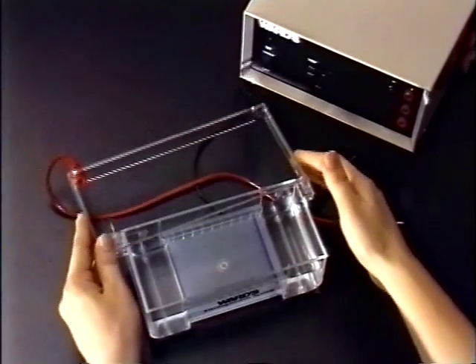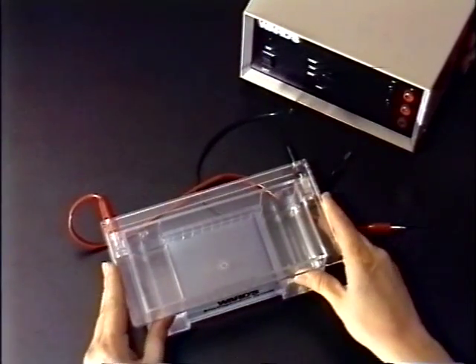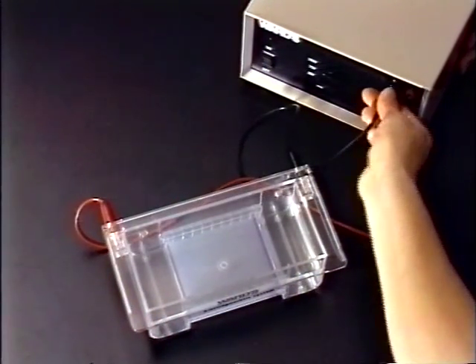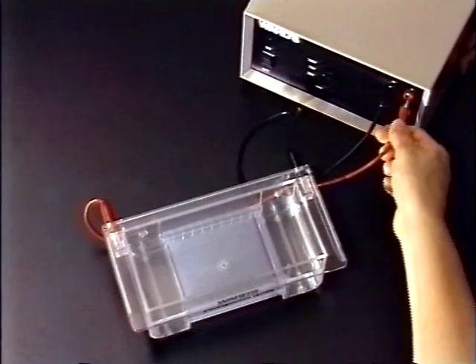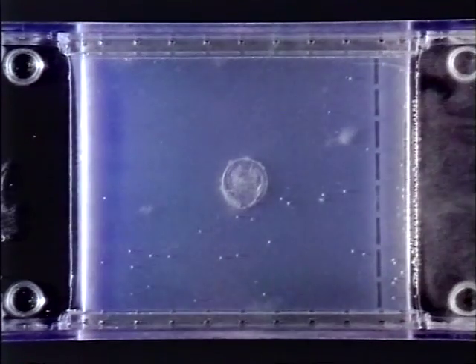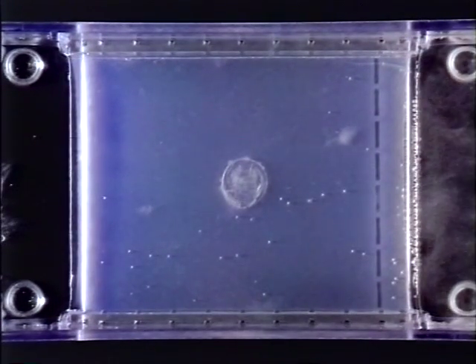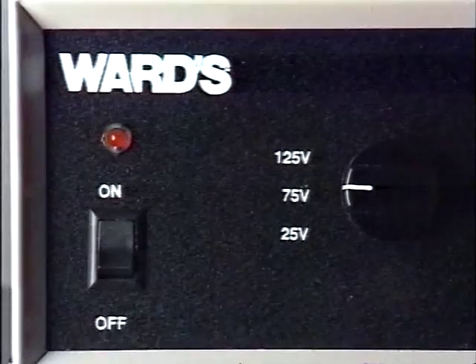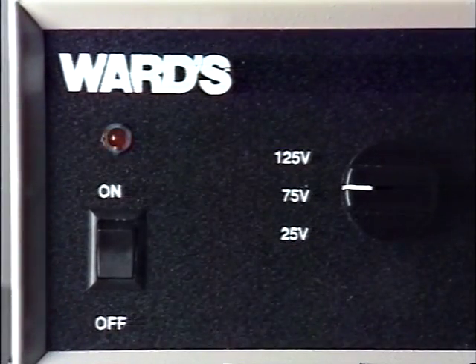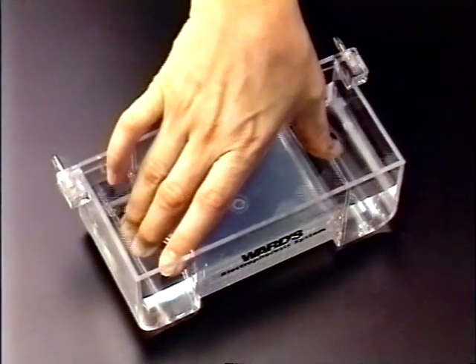Place the top on your chamber. Connect the leads to your power supply and turn it on. The tracking dye begins to migrate towards the anode. When the tracking dye nears the end of the gel, the gel run end point. Turn off the power supply and unplug it. Remove the gel and casting tray.